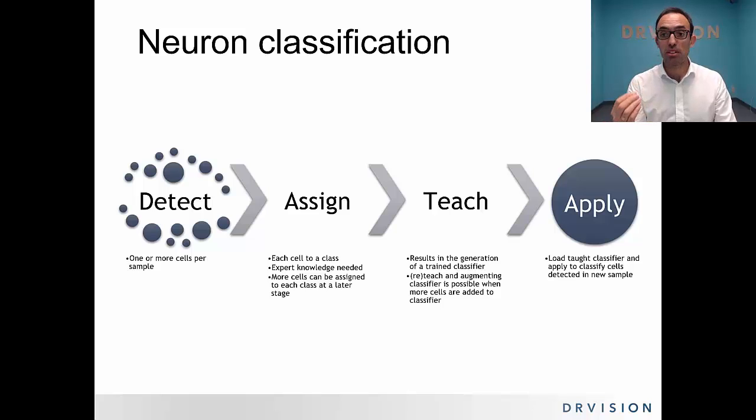And at that moment, the classifier is built, and it will also give you a measure of the likely accuracy for each class, and also for the whole classifier. You can save that off to use later, or to send to a colleague, for example, or to augment later if you want to add more examples, because you may be working over many days. So you may add some examples today, some more examples tomorrow, and you can continually add and make the classifier even more accurate.